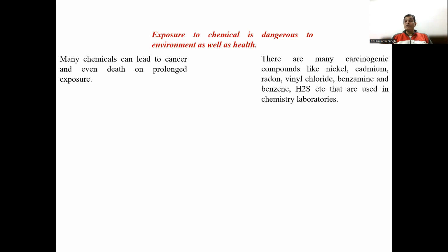These are generally used in the chemical laboratory during the detection of the different acid and basic radicals, during qualitative analysis, and during synthesis. During all these experiments, we generally use these chemicals. These are very highly dangerous.